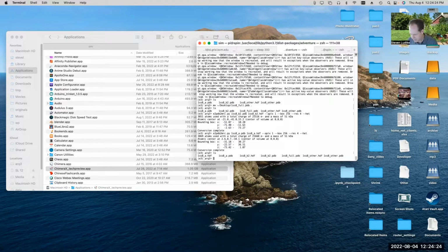So I'm not necessarily doing all this in the most efficient way. I'm trying to balance it with showing you guys things which might be useful to see. Even though you're right, we could probably make it work with e2pdb2mrc with just picking the chains, we might still have the centering issue. So how do we tackle that in this situation? We'll go ahead and run e2pdb2mrc on the full map.